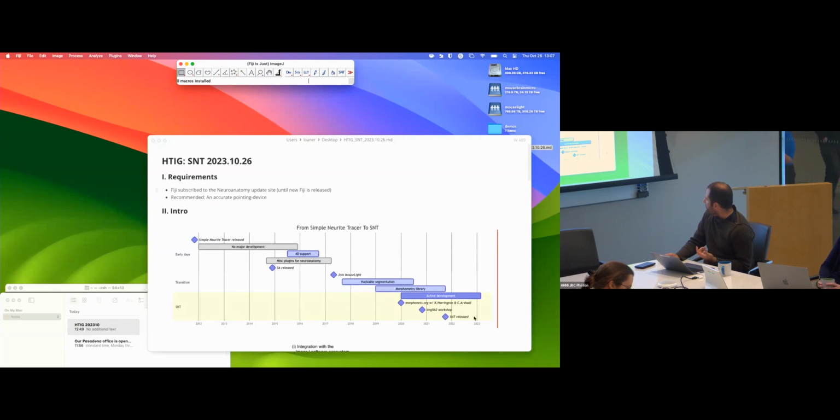Another key point was, during the I2K meeting, the ImgLib2 workshop by the Stephans. I participated in that, and it opened a bunch of doors. Cameron got all excited. We ported all sorts of stuff into ImgLib2, and suddenly things just got faster, better, more efficient. I don't know if it's really because of ImgLib2, but it had been a legacy of 10 years in which things had not been worked on. This was important because suddenly we could do things that we couldn't do before. Then we published SNT, I think in 2021, and it has been really, really popular.